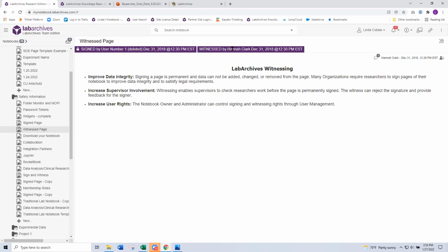I do want to talk about downloading notebook and data, and I know there's quite a few questions that have popped up, so then I'll come back to all those questions. For download, let's say there's a particular page that I want to download, or maybe it's a folder. You right-click on that section of the notebook, and you'll have your PDF. So this is going to be downloading the content into a PDF, which you might want to save or quickly print off. We separately had the question, I think it was from Jed, about downloading your entire notebook.